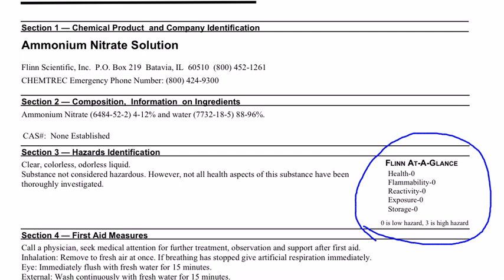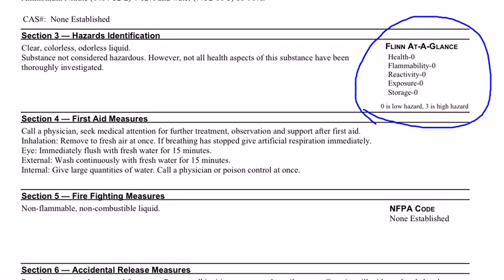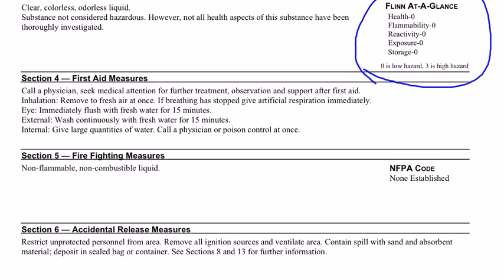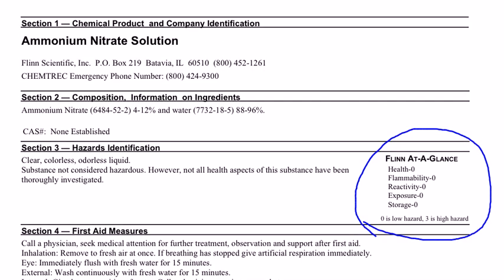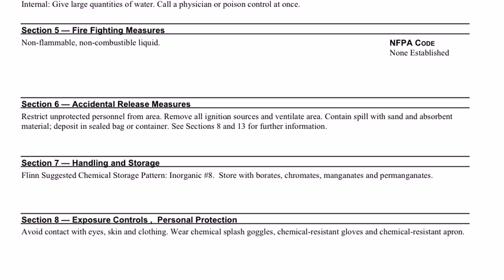Part of the reason for that is the solution we will use in lab is relatively dilute. A dilute solution is much less hazardous than a concentrated solution. This solution of ammonium nitrate is also less dangerous than solid ammonium nitrate. It's important to know what form your chemical is in, because ammonium nitrate solid or crystals have a very different chemical behavior than an ammonium nitrate solution.